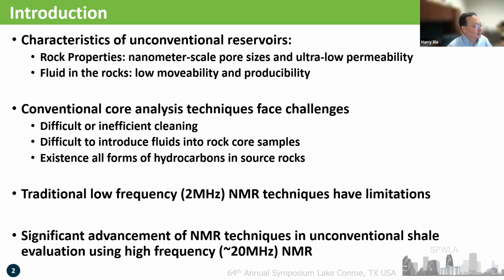Secondly, it's difficult to introduce fluid back into the rock. Once you remove fluid from the sample and try to resaturate it, it's very difficult. And sometimes when you think you have resaturated a sample, it may not be the same as the sample as received.